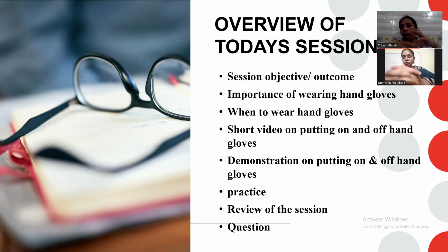And then I'll demonstrate how to put on hand gloves and how to put them off, and then we'll practice together. I will then watch if you can do this alone, and then we'll review the whole session again. And then after that, if you have any questions regarding today's session, you can ask me.